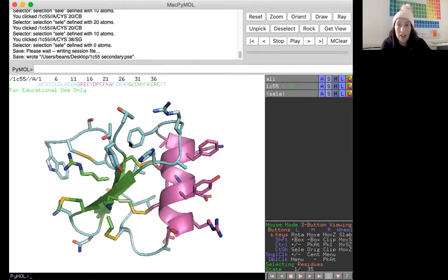So if you were working on a project and you wanted some feedback from me, like, is this a good picture or whatever? I can get pretty particular with, ooh, if you just rotated it just a little more, get rid of this white space over here, just traverse it just a little bit, that would be a higher quality publication picture. So if you had saved your session of the image you're asking for feedback on, then all you have to do is reopen that and do the little tiny tweaks that I mentioned. If you didn't save the session, then you're going to have to start from scratch. And that is a daunting task.